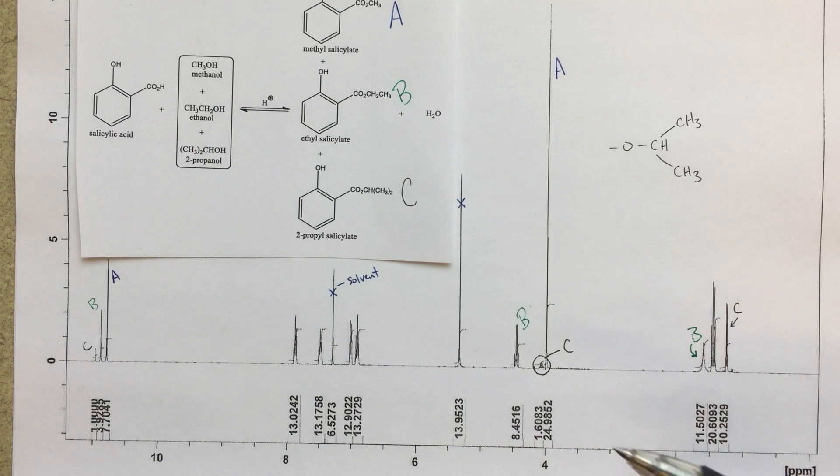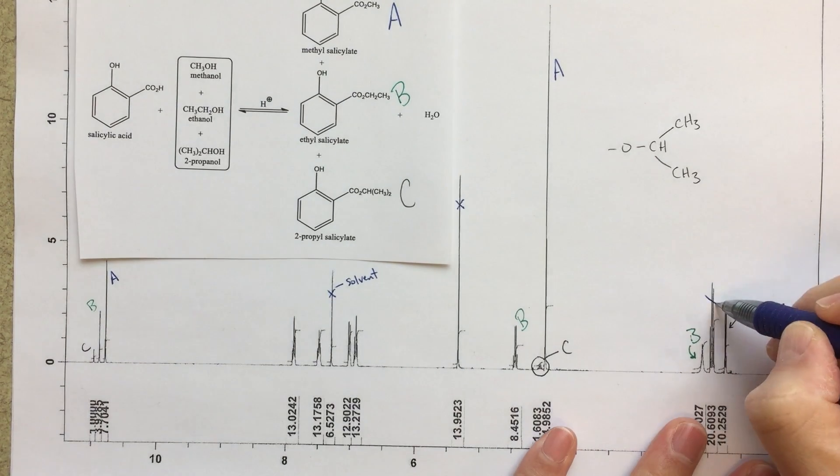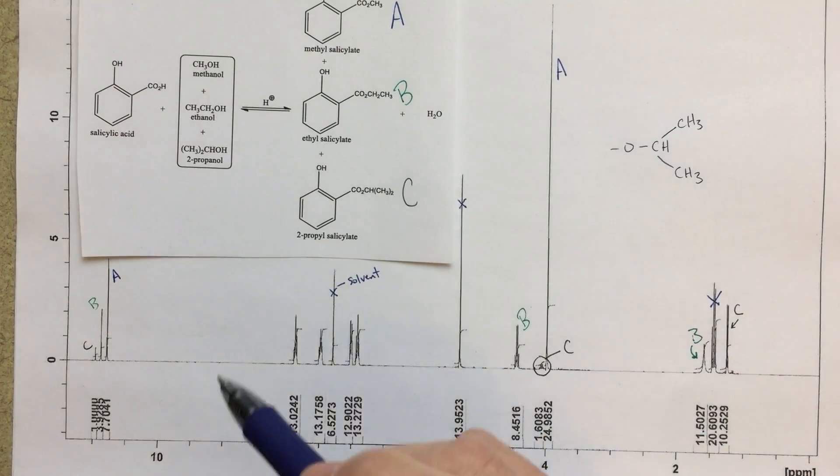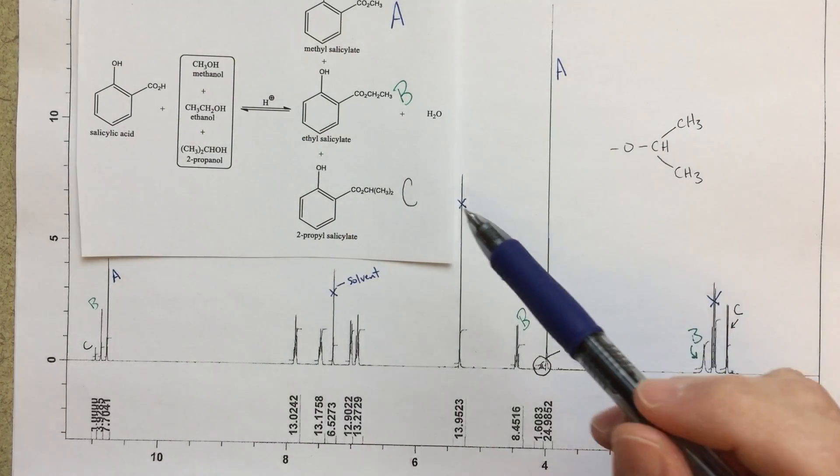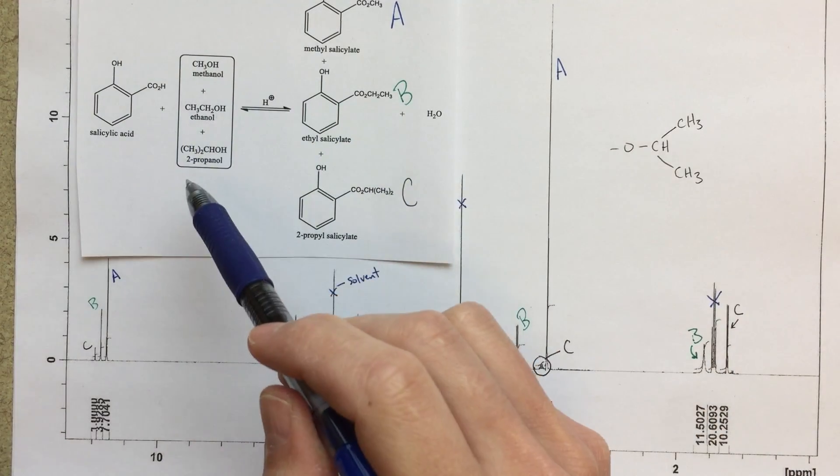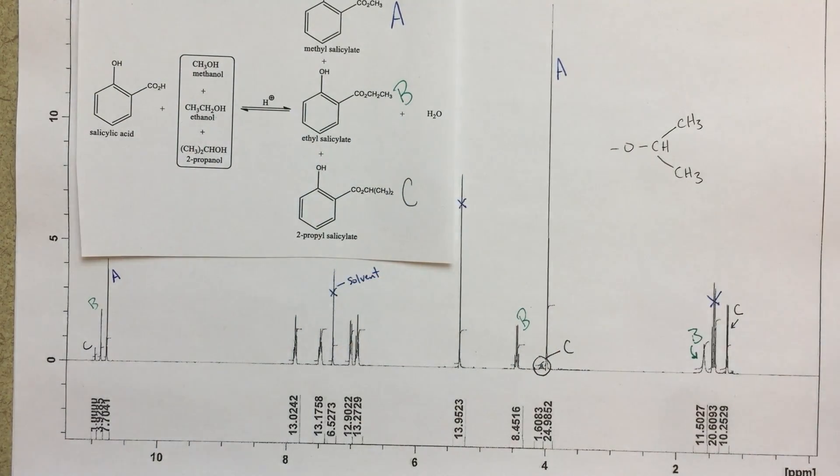Now over here in my OH group, then that means that this last little peak here, that would correspond to C, my 2-propyl product. So at this point in time, we've sort of labeled everything except for this peak right here. And this peak right here that's coming at about 1.5, it looks to me like it's a quartet. And I don't have a good explanation for this peak. I really am not sure. I thought about what other impurities could be in this sample. Do any of their starting materials, would those lead to something like this? And I really honestly just am not sure what this is.